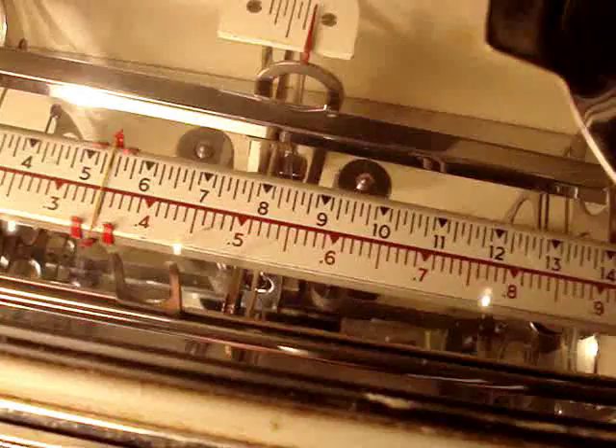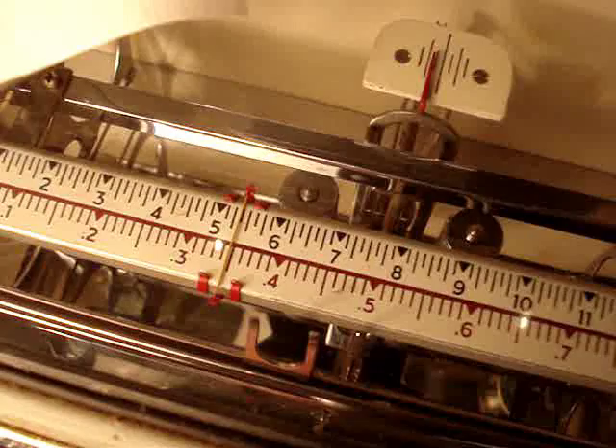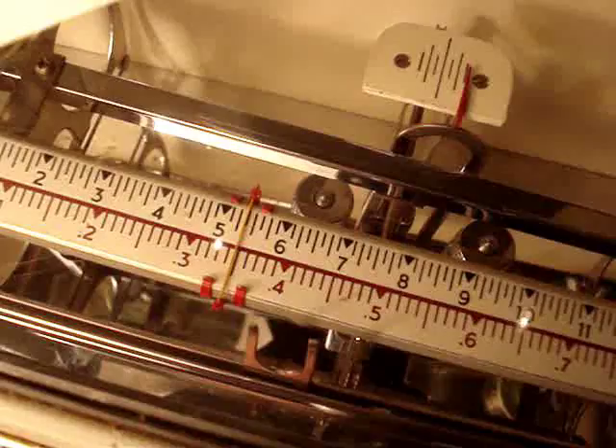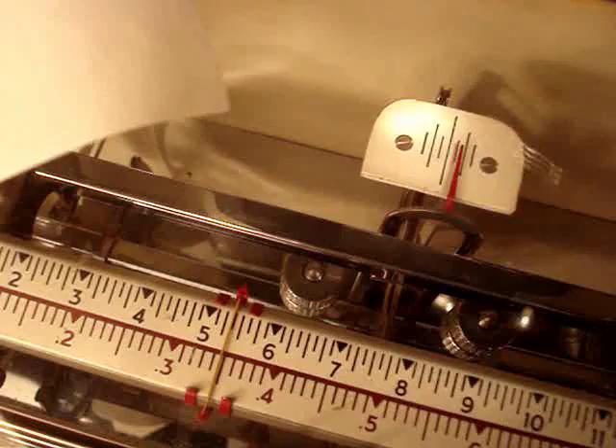So in case you have to weigh something like a postage stamp without the envelope, or maybe a couple of dog hairs, or a diamond, some drugs — you know, whatever — you can do it with this scale. It's the right scale to use. It's a good one.